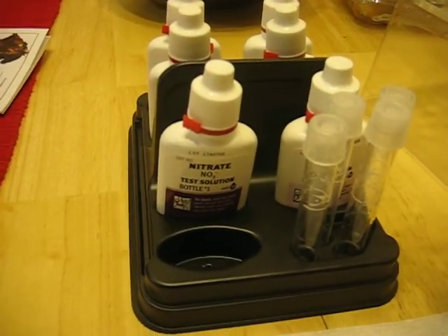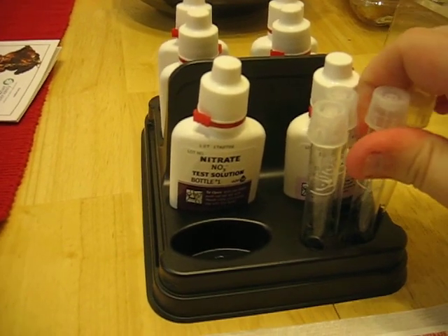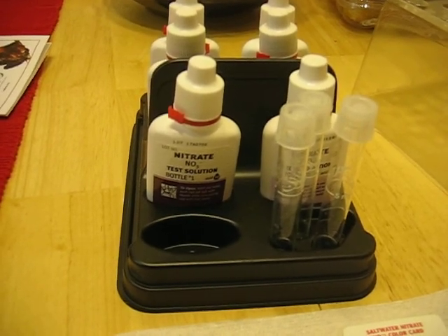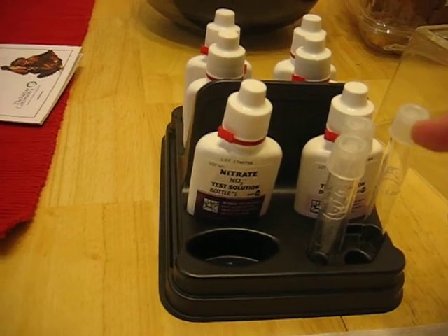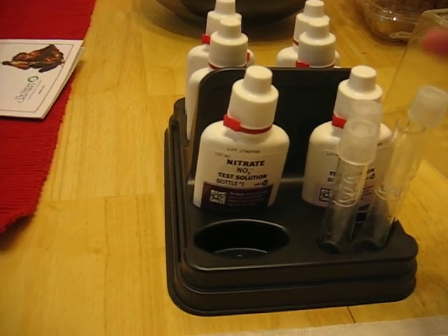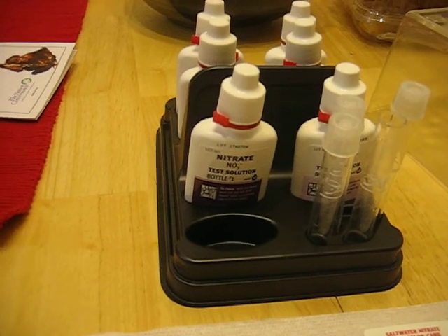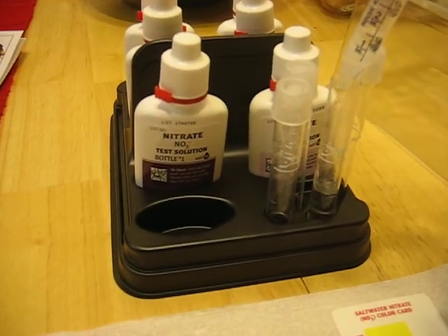I'm going to start one of these tests — I'm only going to show one of them, but they're really easy to do. I'm trying to do this with one hand here. Usually I'll have it in my other hand and use the dropper to fill it, but since I have to hold the camera and I don't have a tripod, I'll just fill it all the way up.